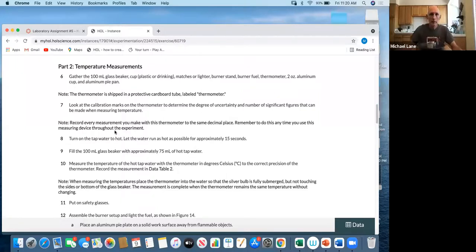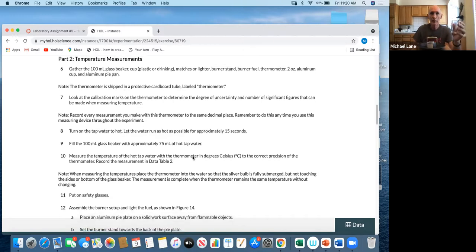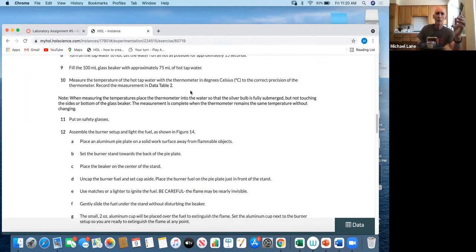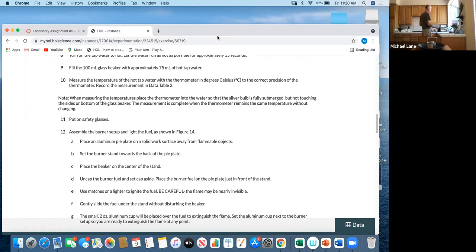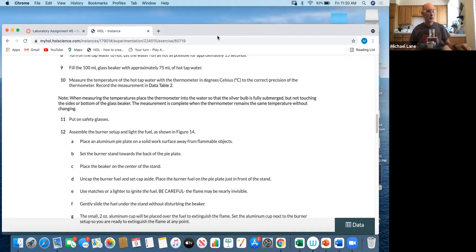It says to fill a beaker with hot water. The purpose of this is to ultimately get the water to boiling. At this point, I am going to put on my safety glasses, as you should, anytime you are working with chemicals or flames, which is certainly what we are doing right now.